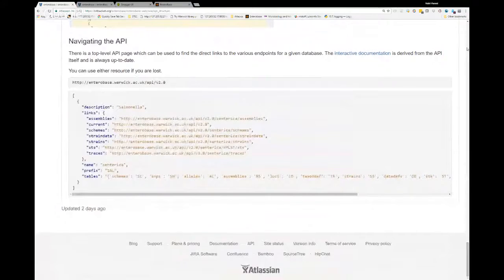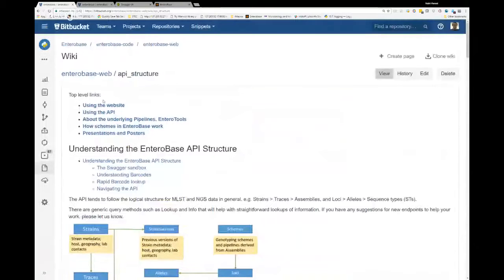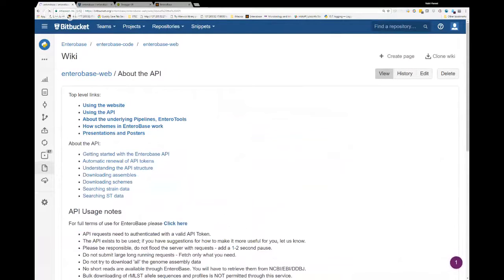All right, so I will start. Any questions? Nope. Okay. All right. API.